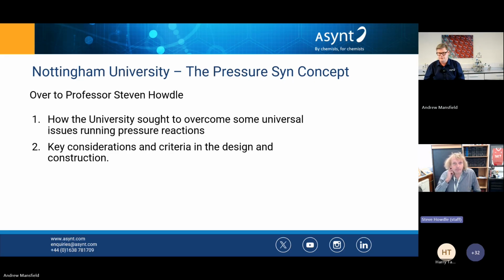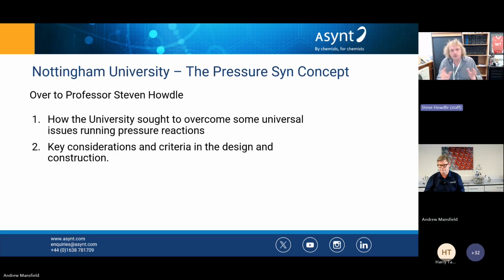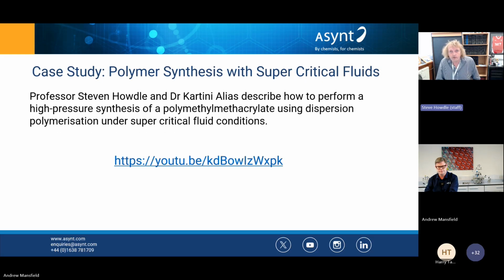So thank you everybody for coming along today. I'm not going to give you a chapter and verse description of everything that we did. I'll just highlight a few points of why we went into high pressure and how we constructed the vessel. Andrew's going to show a video very soon, which will give you the idea of what we've done and how we did it, and how it works. So that will help you to visualize the things that I say.